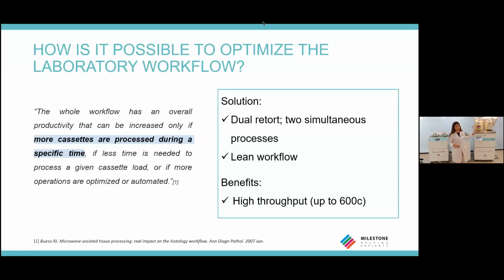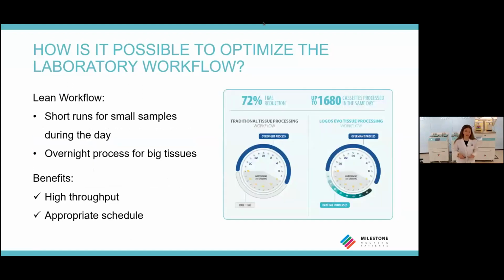And the other very important point is the possibility to apply a lean workflow. But what do I mean by a lean workflow? It means several short runs during the day with thin samples and biopsies.